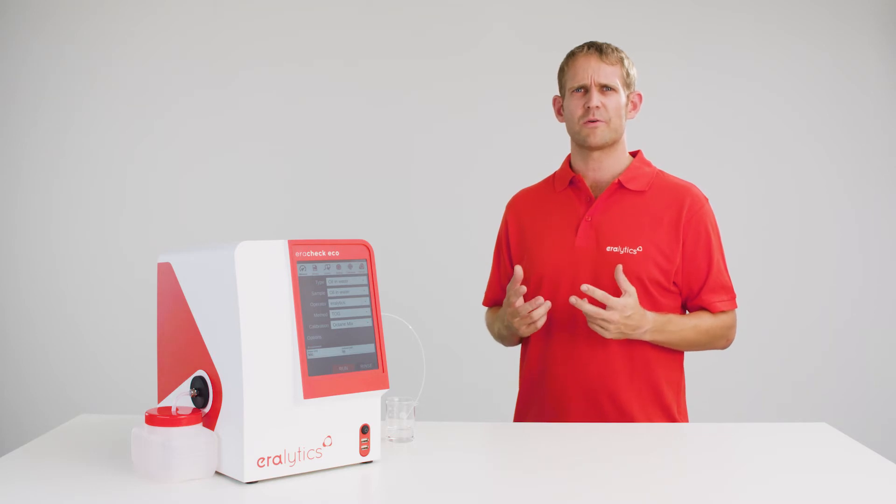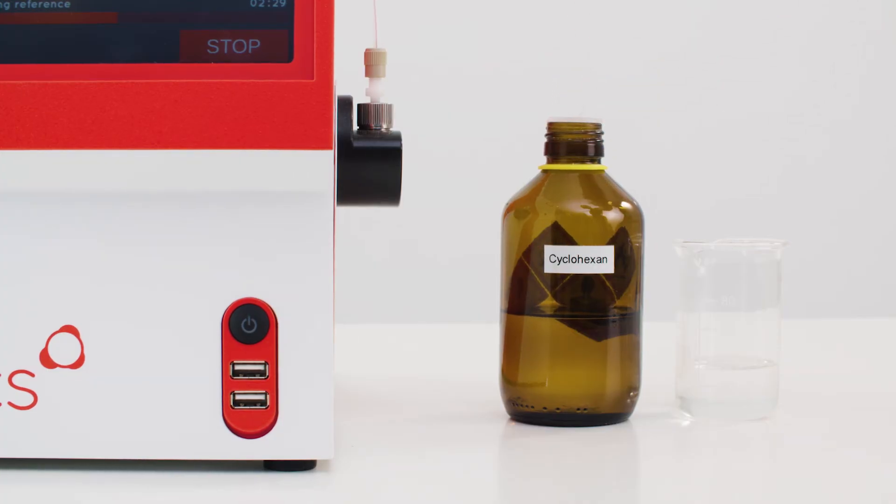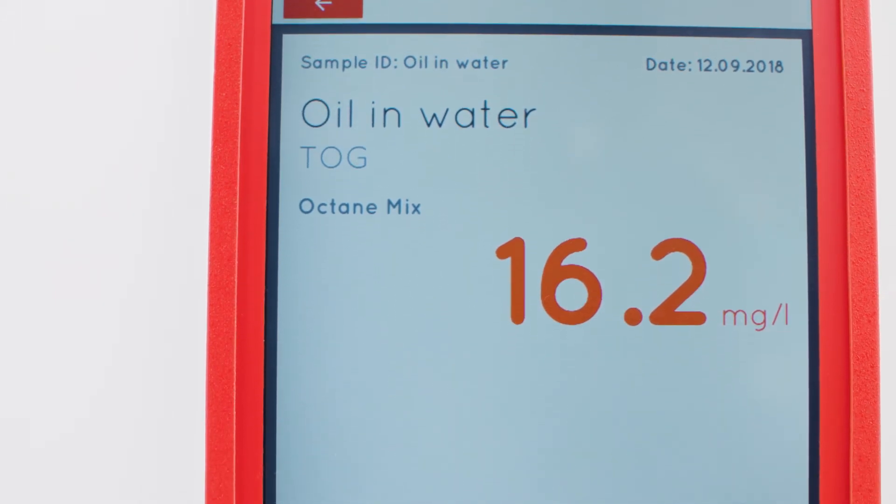AeroCheck ensures a safe, environmentally friendly and cost-efficient measurement of your samples according to the latest ASTM standards. Its results correlate perfectly to other measurement techniques such as gravimetry, gas chromatography and other infrared methods. The measurement procedure is done in three easy steps, with a total analysis time of only a few minutes.